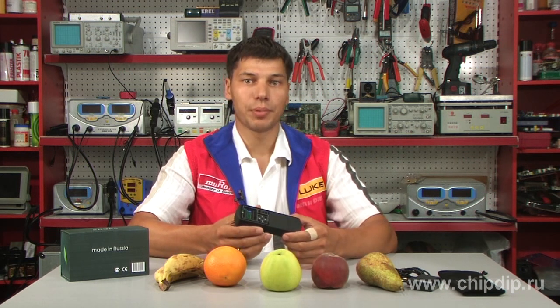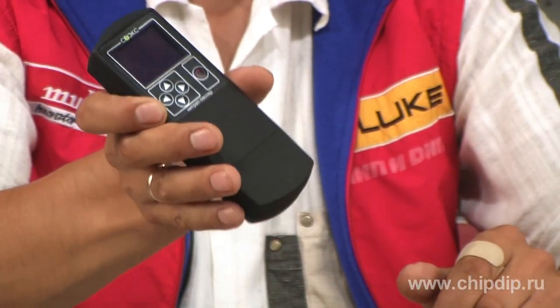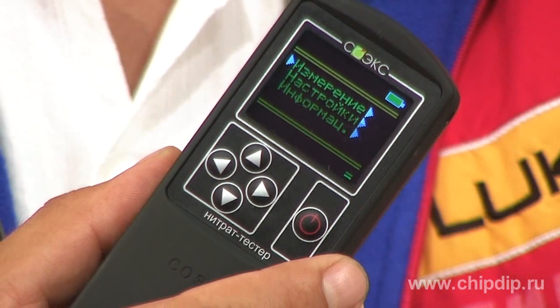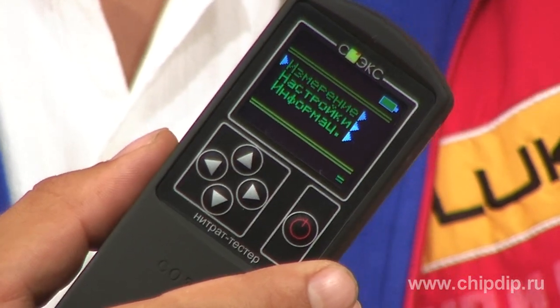The Soex nitrate tester is a device of 105 grams. It can fit in your hand so easily and comfortably. It is equipped with a color OLED display that makes it easy to see the information both in a dark room and in bright light.